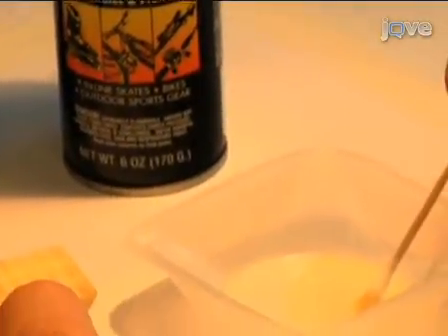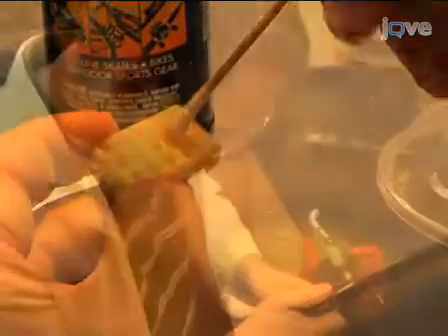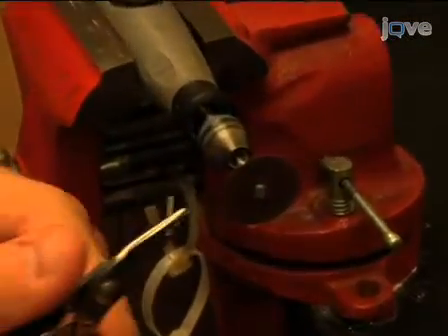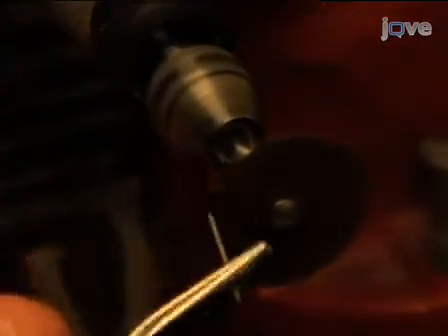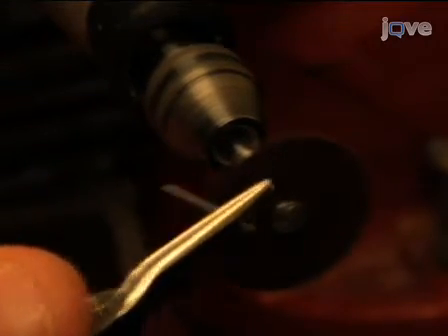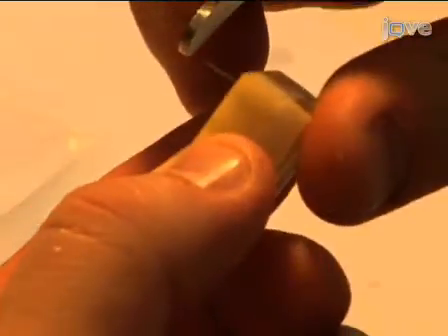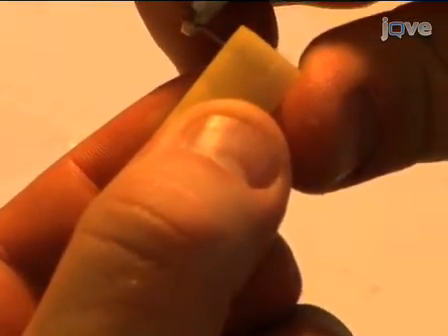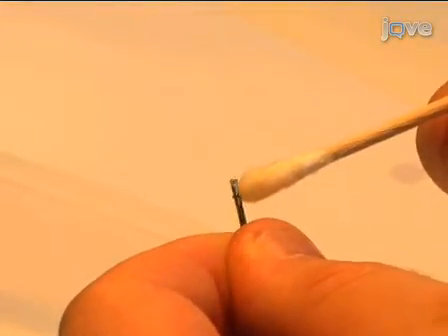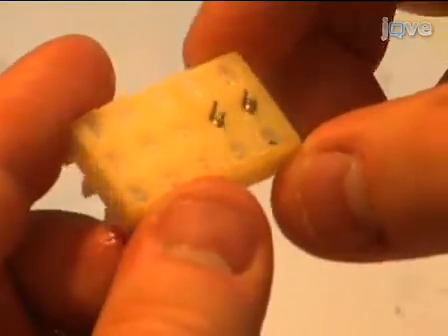Line the mold with a Teflon-based lubricant to prevent the dental acrylic from sticking to the mold. Scuff the top 2 to 3 millimeters of a 14 millimeter long 23-gauge stainless steel support post with a grinding wheel so that it will be firmly secured in the dental acrylic. Insert the support post into the smaller hole of the mold so that the top of the post is above the top of the well. Apply a thin film of Teflon-based lubricant to a screw and insert it into the threaded hole until the threads are just below the bottom of the well.